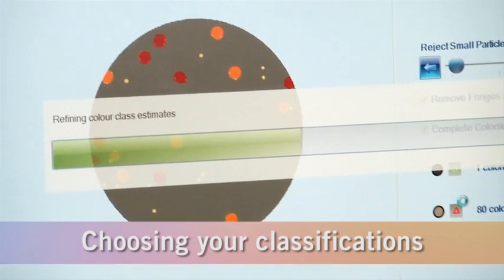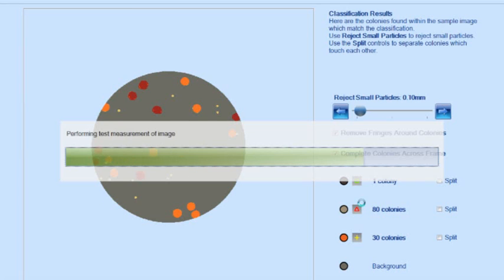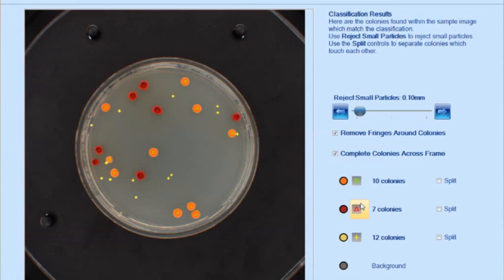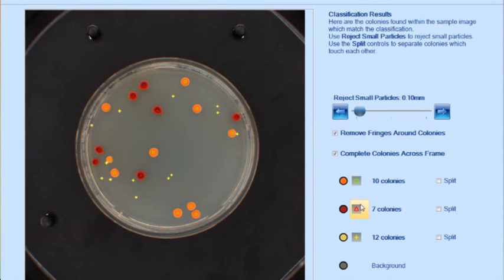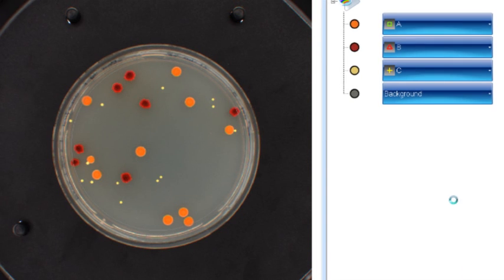Protocol 3 is also unique in that it has the facility for classifying by size, shape and by color, just as quickly and easily even on a low contrast plate where color definition is weak.